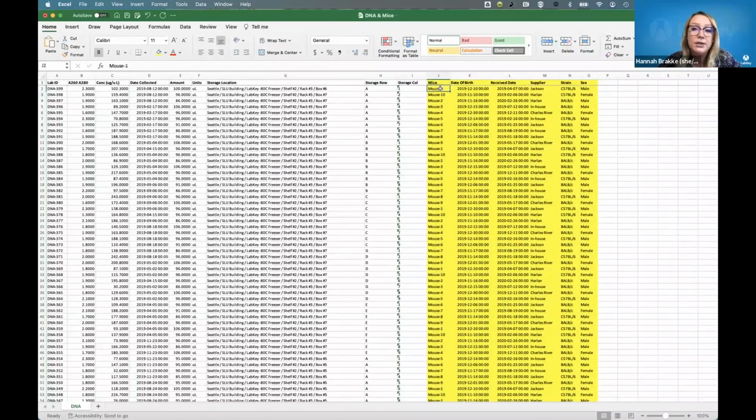So for each sample, I'm capturing the mouse, I'm capturing the date of birth and the receive date and the supplier. So, for mouse 1, I'm actually inserting this multiple times. This feels pretty redundant. It feels error prone. It feels annoying to have to do. So what we want to do is actually extract this data and put it in as a source, and then really get that lineage relationship, but then also reduce that redundant data entry.